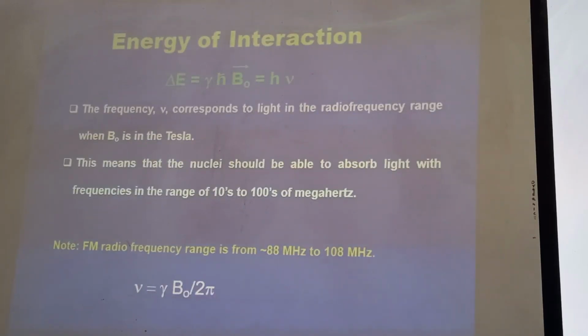Why? You have a molecule. You can have carbon in the structure, hydrogens, nitrogen, oxygen, all these different types of nuclei present in a molecule. But when you put your sample inside the machine and you tune your radio frequency transmitter at a particular frequency, you see only one type of nuclei.